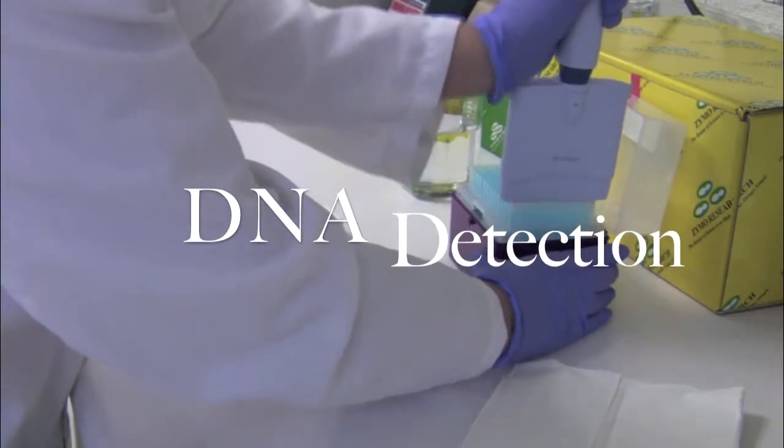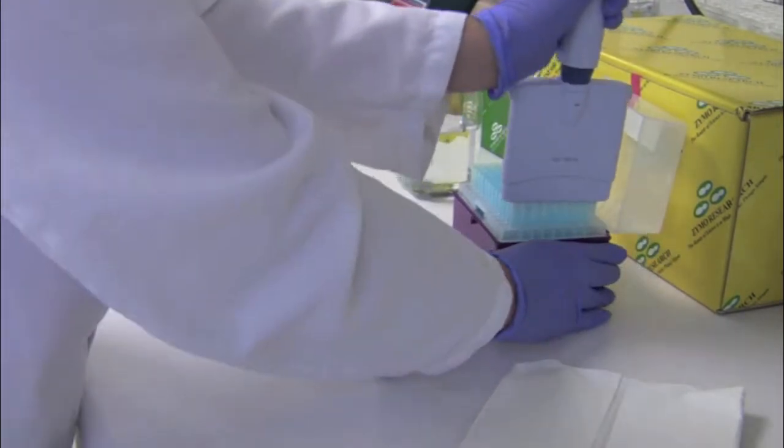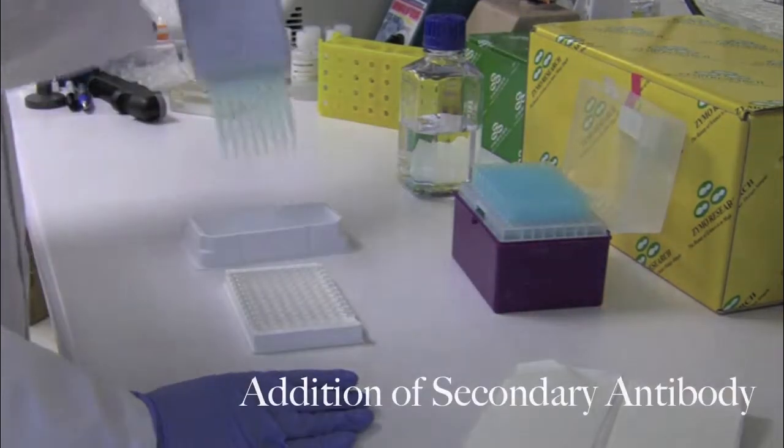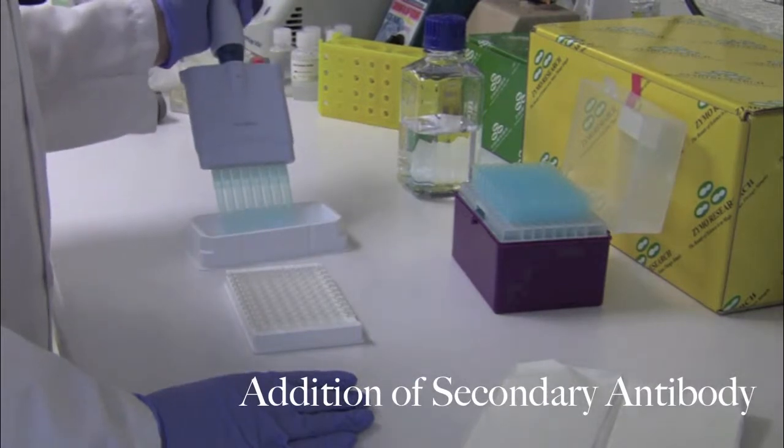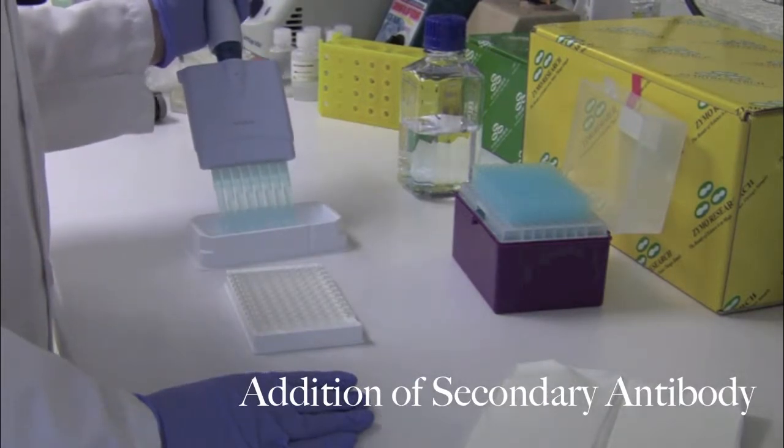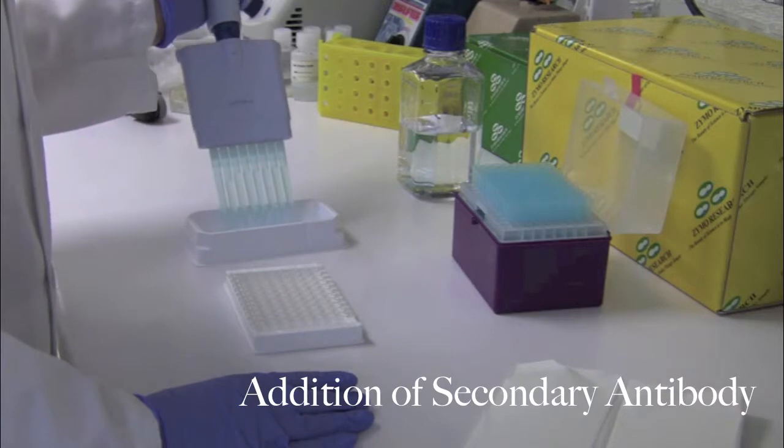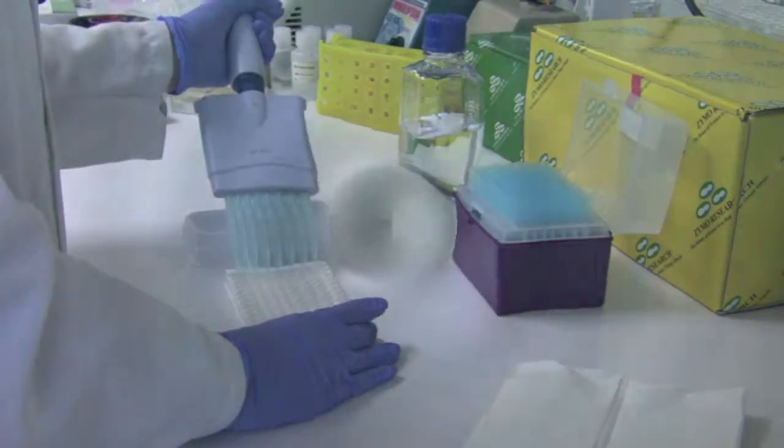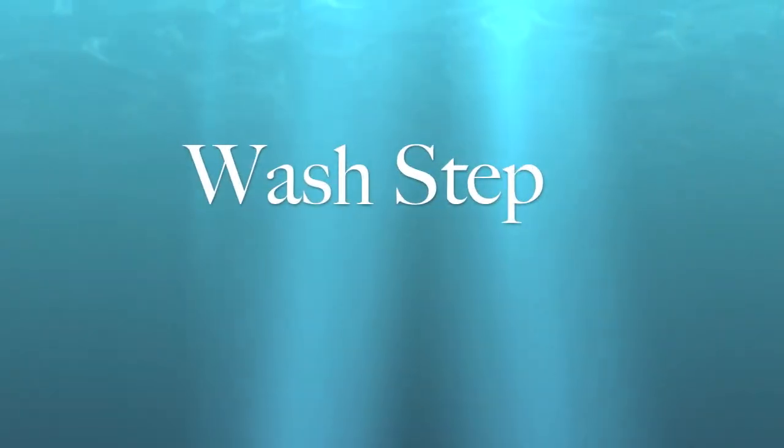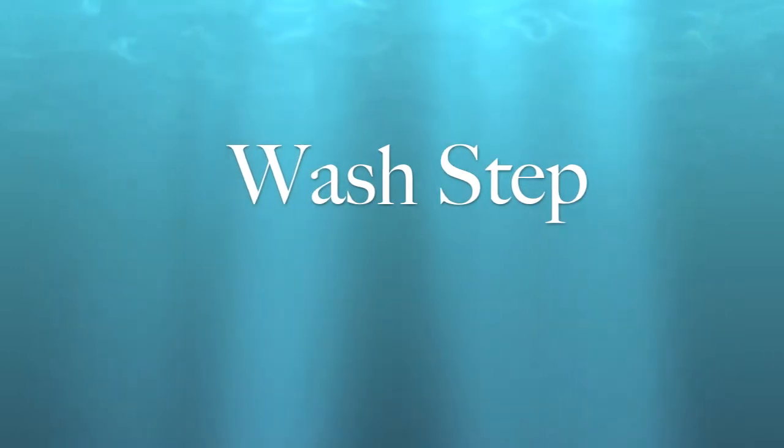Wells that contain 5-HMC DNA bound to the polyclonal antibody will then be detected by an anti-DNA horseradish peroxidase conjugated antibody. This is done at 37 degrees Celsius for 30 minutes. Any anti-DNA HRP antibody that did not bind to DNA will be removed during a wash step.